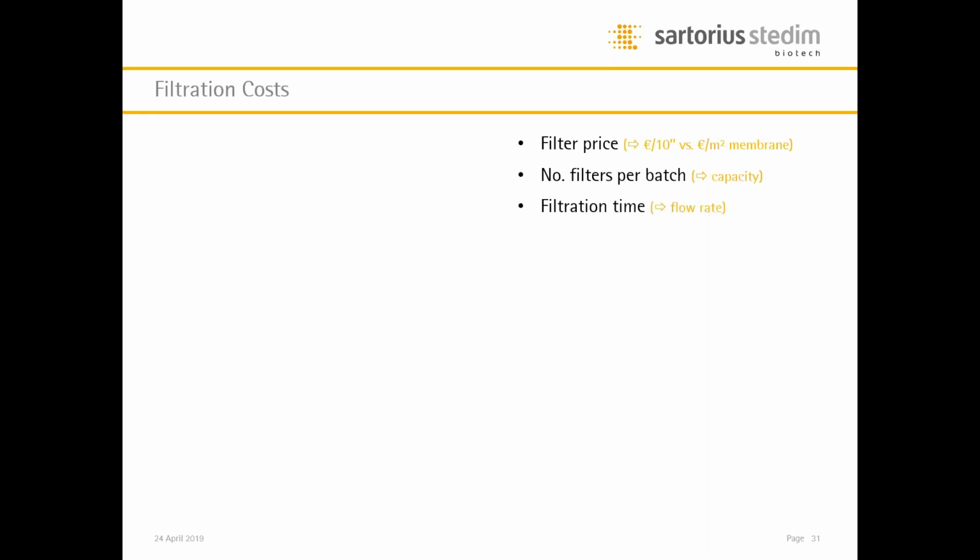Filtration time, of course, the flow rate, time is money. Water consumption, the wettability of the membranes can differ significantly. And don't forget, you have to wet your filter reliably before integrity testing. And this can be a huge amount of water being used there. And this can, of course, make a difference because we are not talking about cheap water, but in most cases about WFI with a certain value.